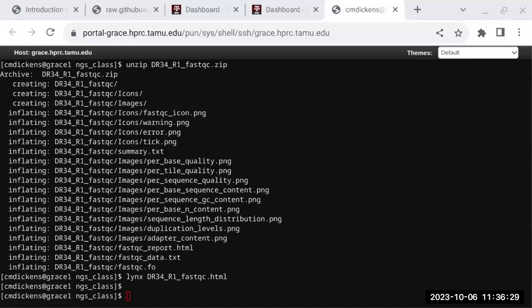When we index a genome, we index it for STAR, HISAT, SAMtools, Picard, and BWA. So we create an index for a lot of different tools. That way you don't have to create the index yourself and save it. You can just have us put it in a shared location, and we'll create all those indexes for you at once.